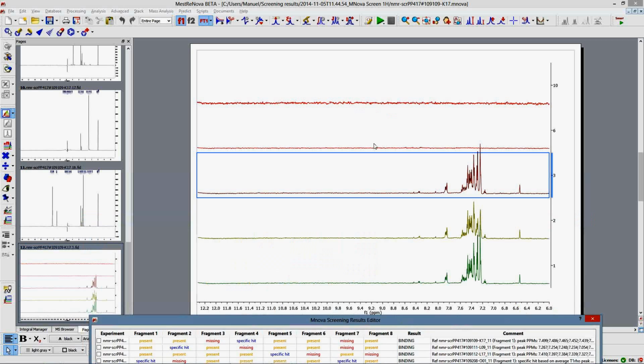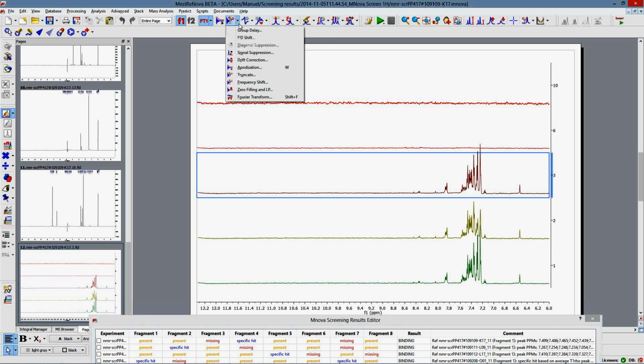This doesn't mean, obviously, as you can infer, that the sample hasn't dissolved, just that the sample has no representative peaks in that region. If we want to have a full visual inspection, we can perform a cutting operation, so you can look only at the region that we are most interested in.